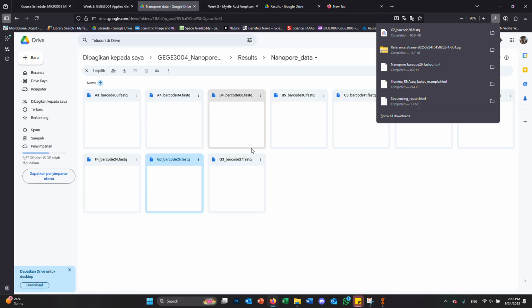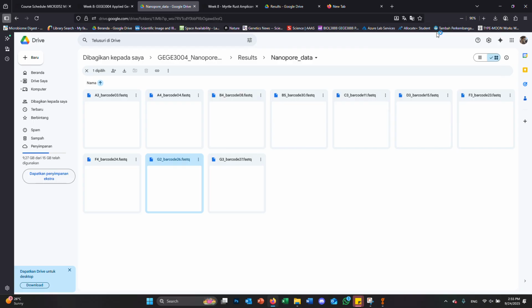When you map to the reference, you will need to choose your reference sequence. I'm not sure what will pop up for you. For me, I have to choose it because I have lots of different things that I've been doing in Geneious. It might automatically come in for you. No, you've chosen your mapped reference. We then have a few other parameters. Has everyone managed to do that bit? Choose your reference sequence? Yeah, beautiful.